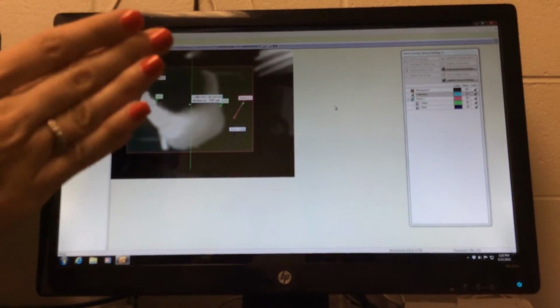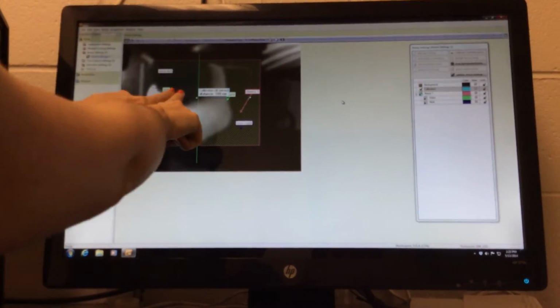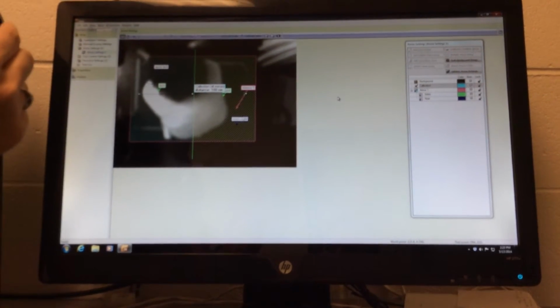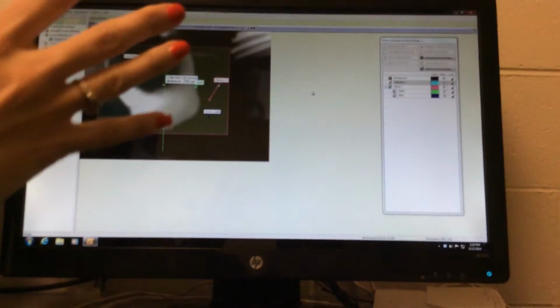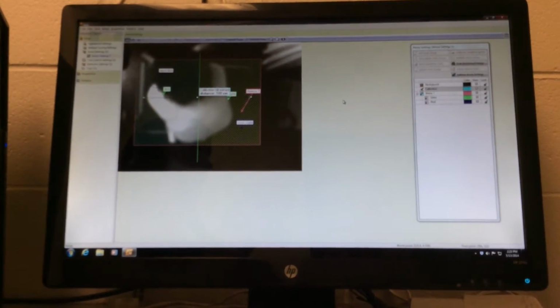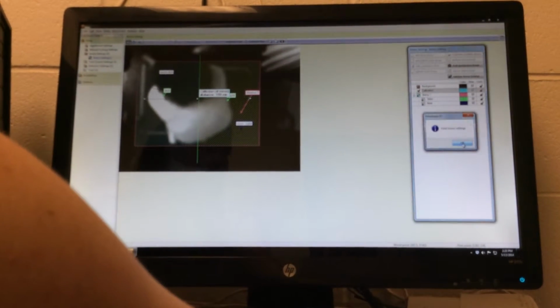If I'm doing something like the plus maze, where I've got a short distance on the arms, but then the longer distance across the whole thing, then I normally will do a distance from one end to the other, and then also tell it what that short distance is, just to give it that one extra little hint of what size the arena is supposed to be, because it's a weird shape. But for something like this, 1 calibration will be just fine. And then we click validate, everything's good.